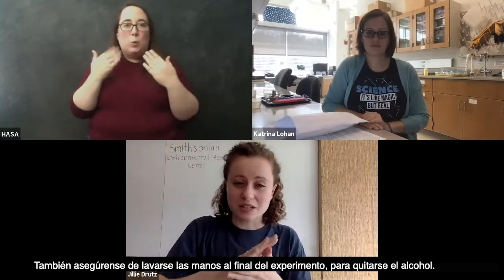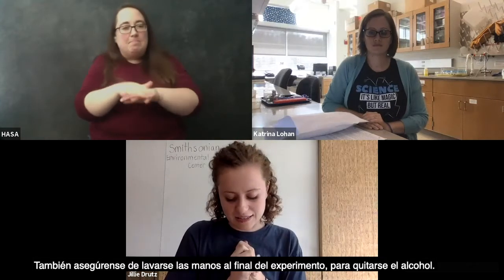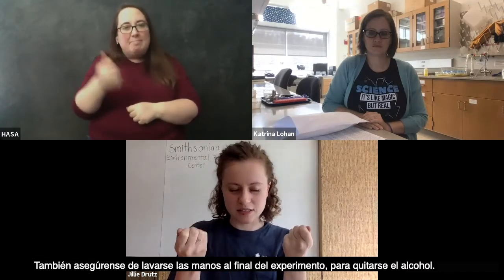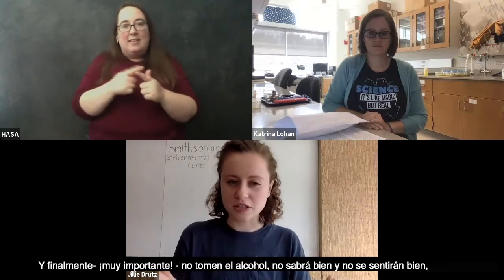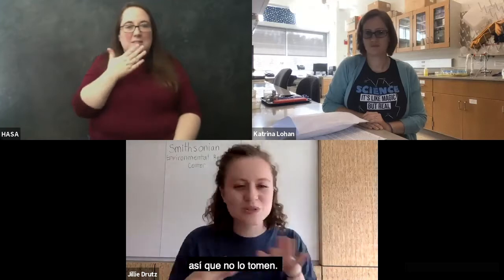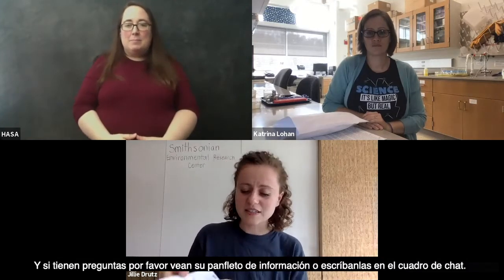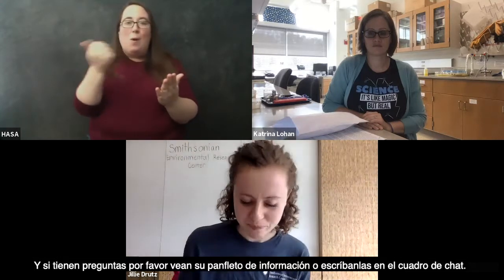Also, make sure you wash your hands. Really wash your hands after this, and make sure you really remove the rubbing alcohol if you get it on your hands. You shouldn't, but just in case. And last, very important, do not drink the rubbing alcohol. It will not taste good. It won't feel good. So don't drink it. And if you have any questions, definitely refer to the safety sheet or put any questions in the chat.